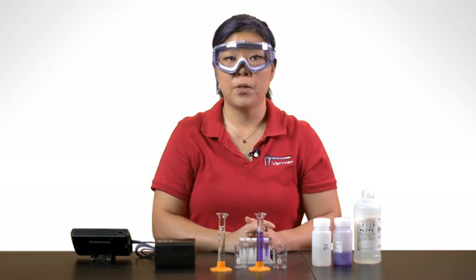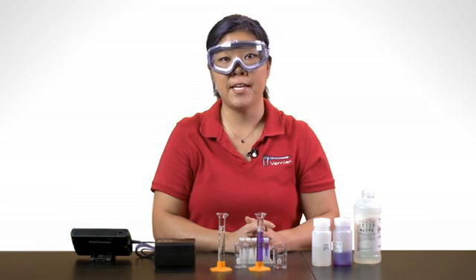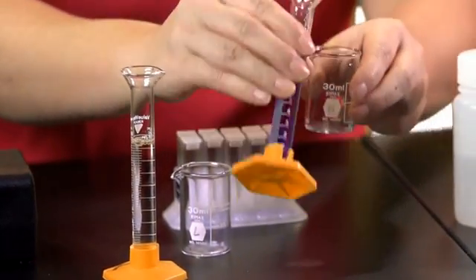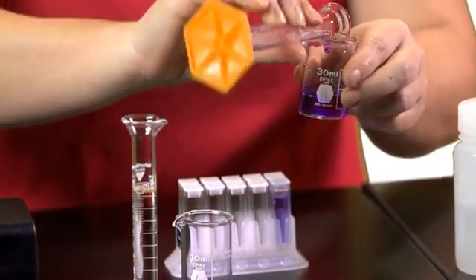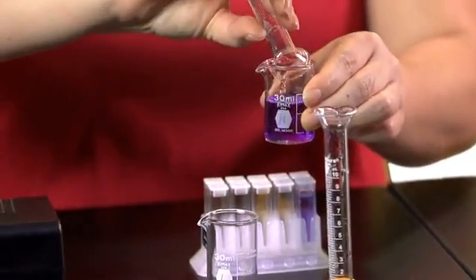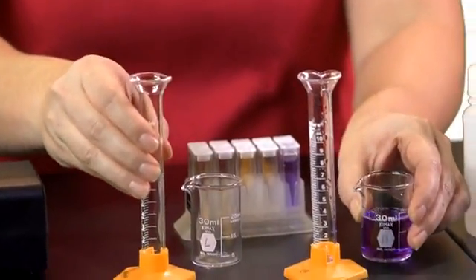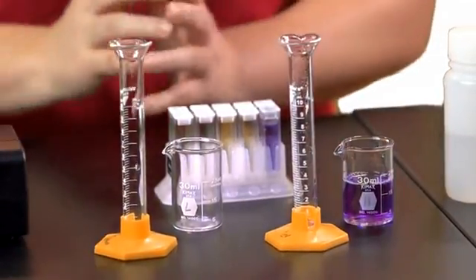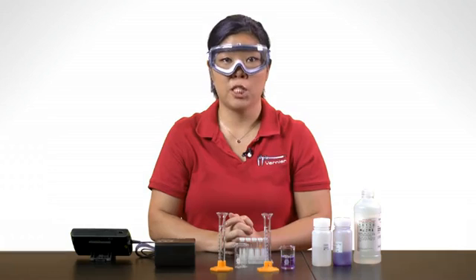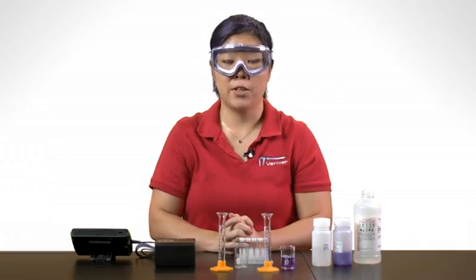As you can see in this demo, the purple color of the crystal violet fades as the reaction proceeds. One way to measure the rate of the reaction is by spectroscopy to follow the fading color.